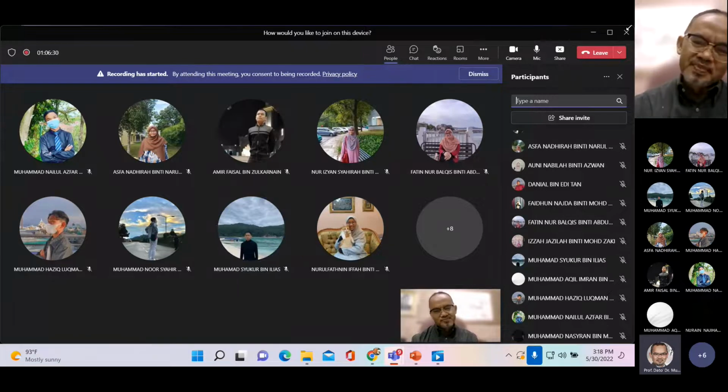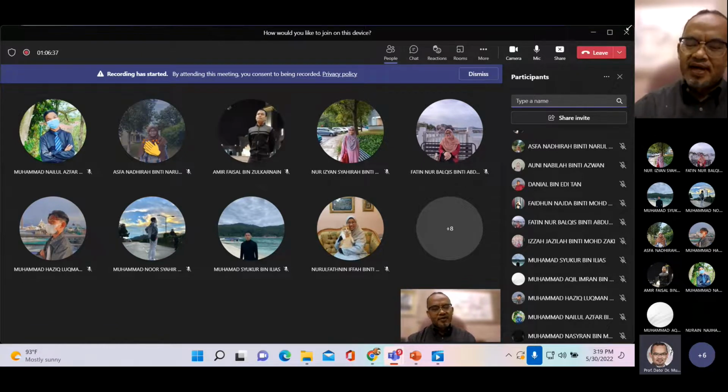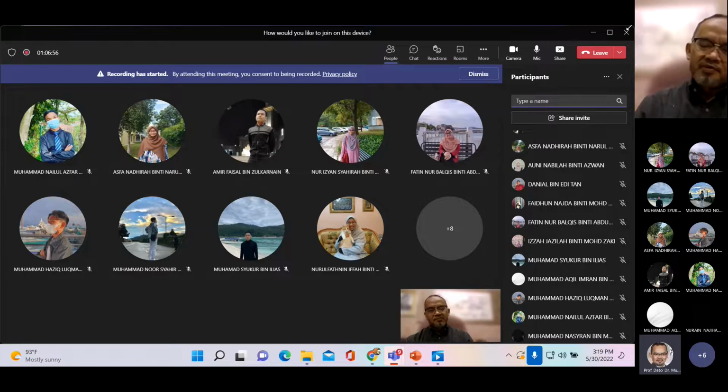Okay, jadi kita perlukan dua because we need two range of light. Satu dalam UV, satu dalam visible. Jadi mula-mula bila buat scan, dia akan tunjuk UV sampailah 370, pop dia berhenti, dia akan naik pula yang visible, sampailah 750 sampai 800. Okay, that's why they need dua. Okay, light source.